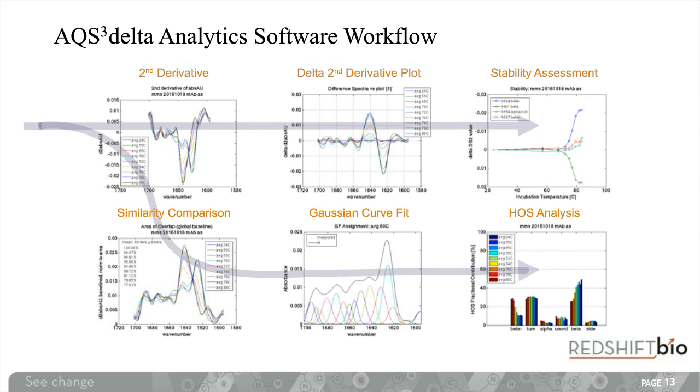And this is very useful because it will show you very clearly where the biggest differences are between your samples. And perhaps will allow you to tell whether or not the differences between two samples are real or significant enough to provide you with some information.